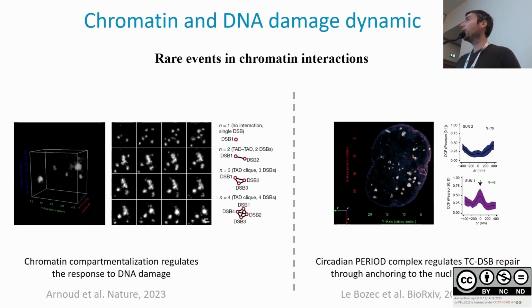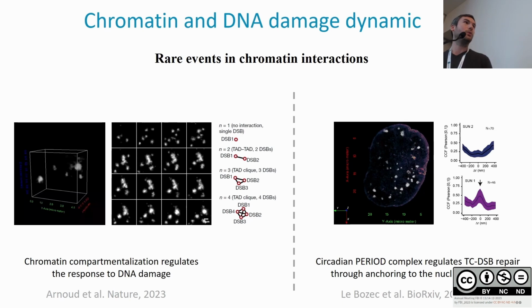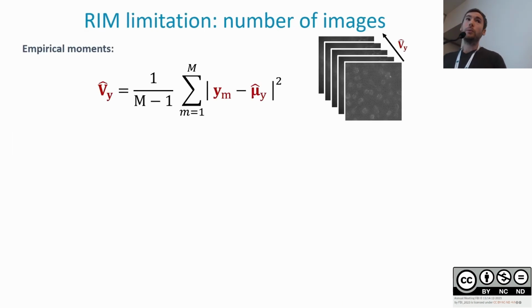Yeah. So that's all good news for RIM, but now let's talk about limitations and what we are doing to work on them. The number of images we need. That's a price to pay right now.